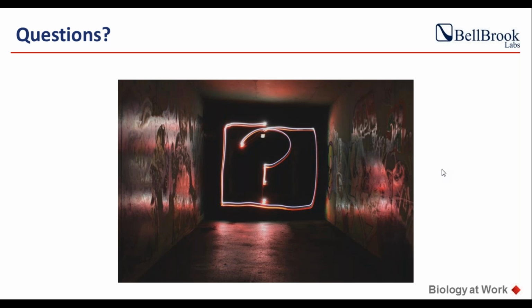If you're using the terbium labeled antibody: the antibody in its native form, for example in the FP assay, is kind of rugged. But when you have terbium, it's a little bit finicky because you have attached something to it. It doesn't like to be mistreated. So again, good lab practices are always helpful. Aliquot so you don't have to freeze thaw it more than 4 or 5 times.